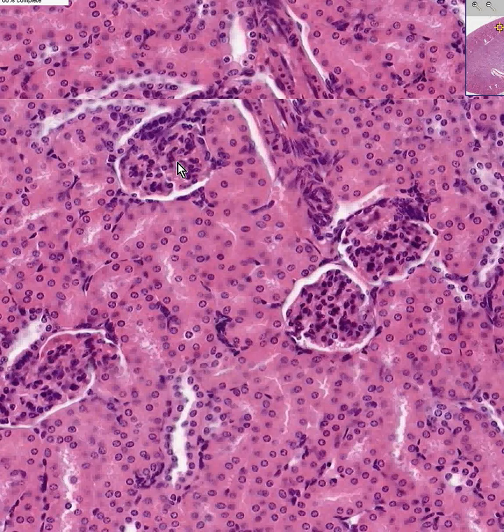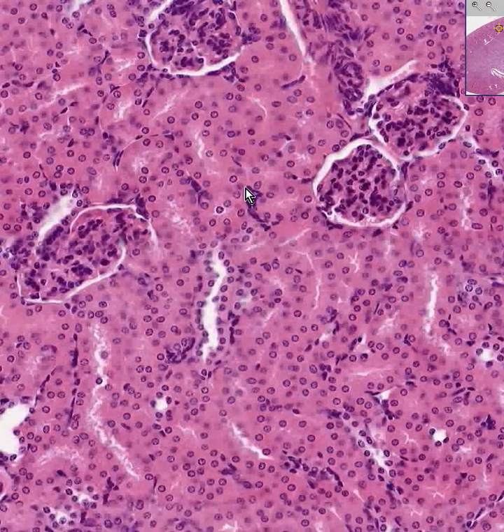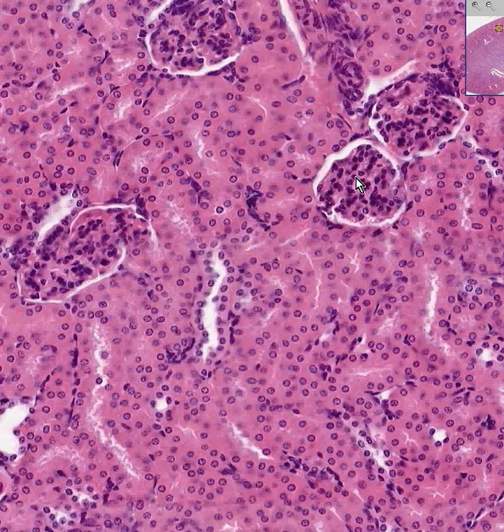Here's all proximal, here's all distal, here's a glomerulus. You know the three types of cells in the glomerulus. You know that the outside is lined by the parietal Bowman cell. You know that the visceral Bowman cell is called the podocyte. You know that the other two types of cells in the glomerulus have to be mesangial cells and capillary endothelial cells. We've already seen the beautiful, beautiful deeper part of the kidney called the medulla.